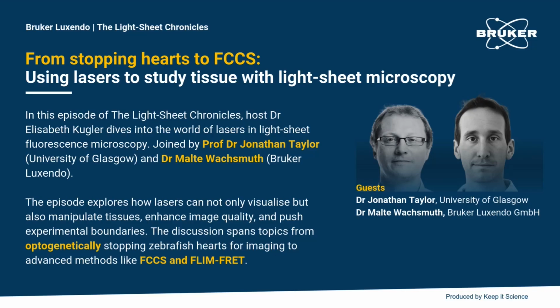And from this mean dwell time, you can learn a lot about the size of the molecule, its molecular weight, and also its binding status. Think of a small molecule that binds to some extent to a larger complex. Then obviously the small molecule that is somehow fluorescently labeled has a much shorter dwell time as a free molecule, and a much longer one when complexed to its larger binding partner.